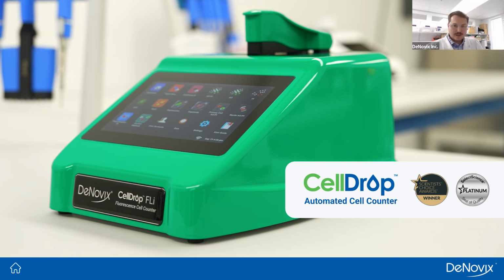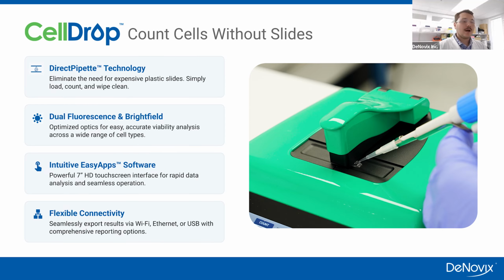So, enough about me. Let's get into why you're here. So you may be asking yourself, how does this CellDrop count without slides? First and foremost, it's the direct pipette technology because it eliminates the need for expensive plastic slides. This instrument has dual fluorescence and bright field technology, which is great for trypan blue and acridine orange and propidium iodide counting. It has a suite of apps for multiple workflows and an HD touchscreen, just like your smartphone or tablet. And finally, it has flexible connectivity to export your data in multiple ways.